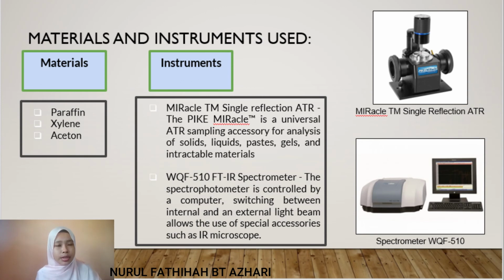The materials used in this journal are paraffin, xylene, and acetone. The instruments used in the journal are, first, the MIRacle Single Reflection ATR. The PIKE MIRacle is a universal ATR sampling accessory for analysis of solids, liquids, pastes, gels, and intractable materials. Second, the WQF 510 IR spectrometer.